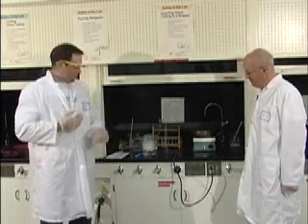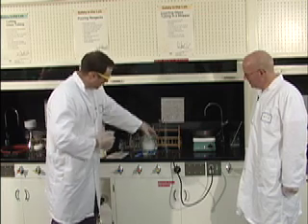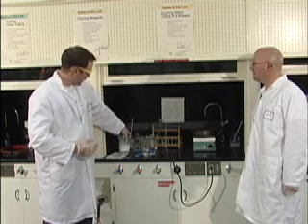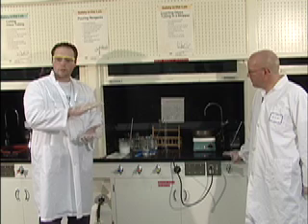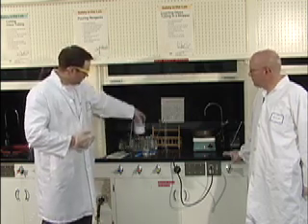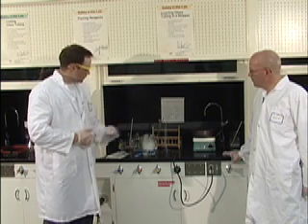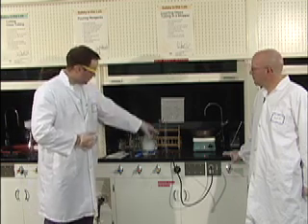Now, with your ice bath, basically what you're going to do is take a 1,000 ml beaker. Do we have one of those in our drawers? No, we don't. Actually, those will be on the side. So a 1,000 ml beaker, you're going to fill it about 200 mils with water, and then add ice. As soon as you've got the ice in there, you're going to put in your 600 ml beaker so that it just rests like that, and you're going to cover it up with a watch glass.